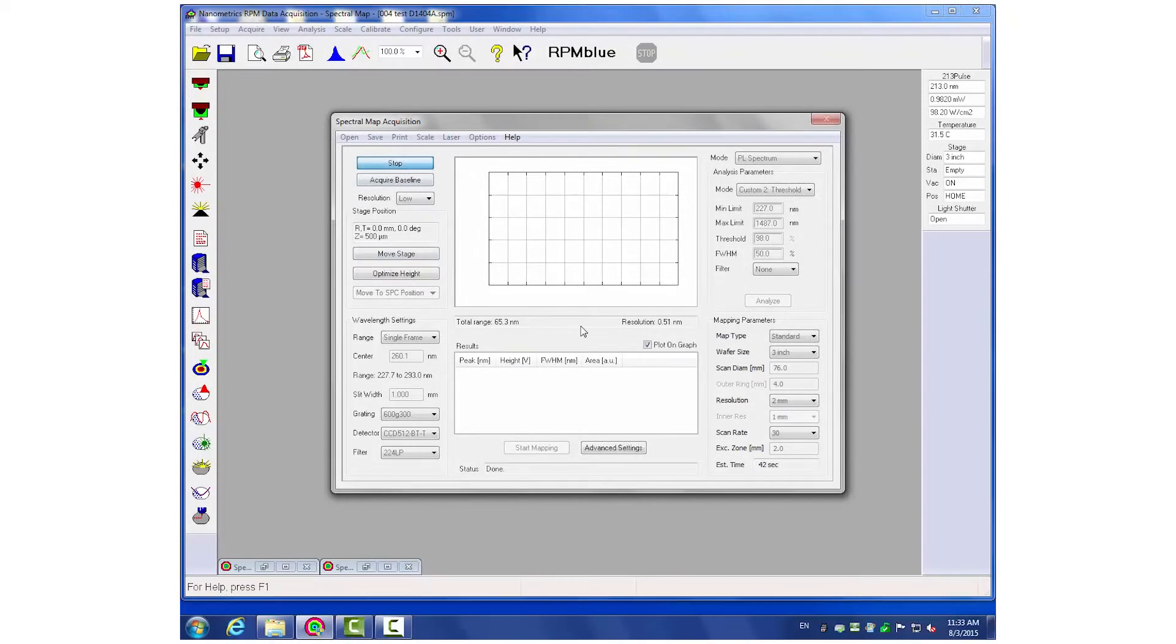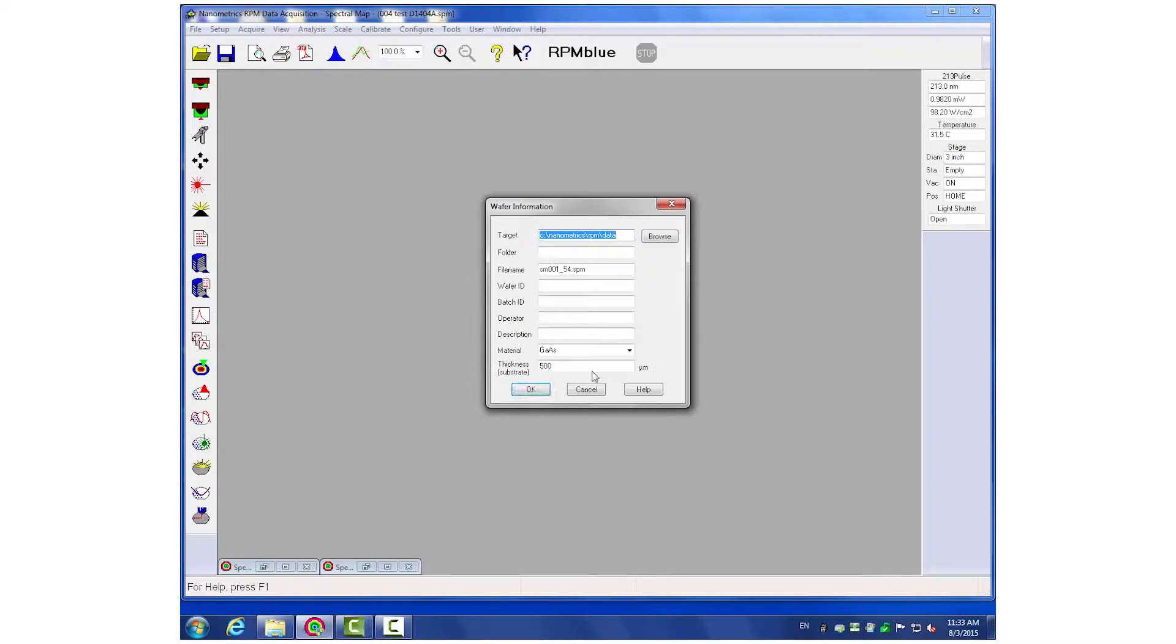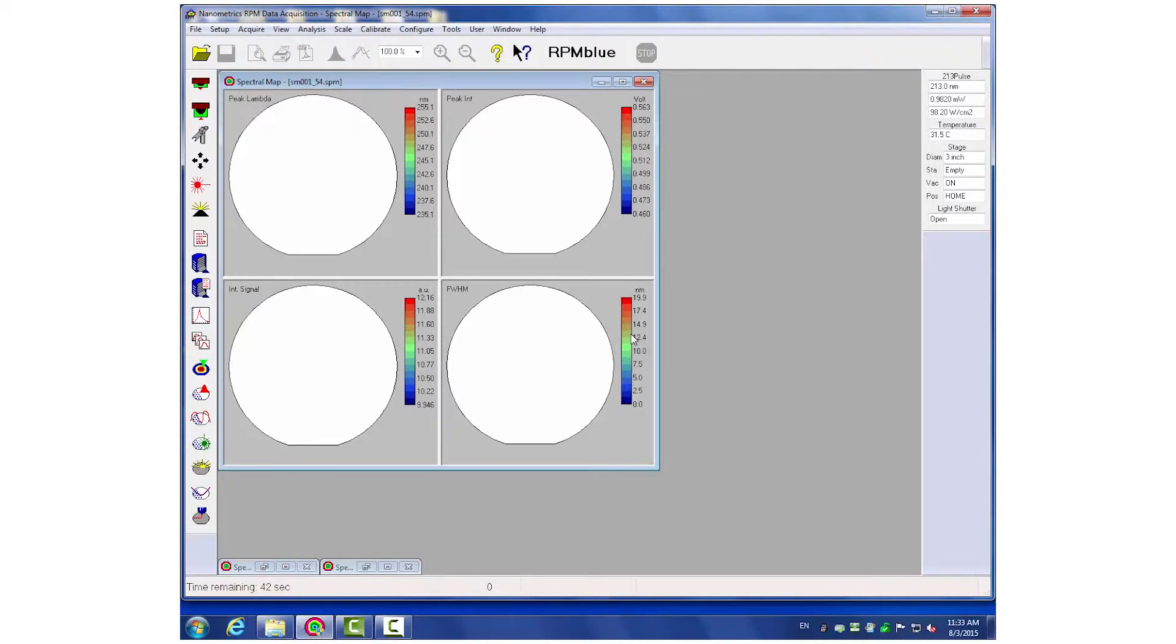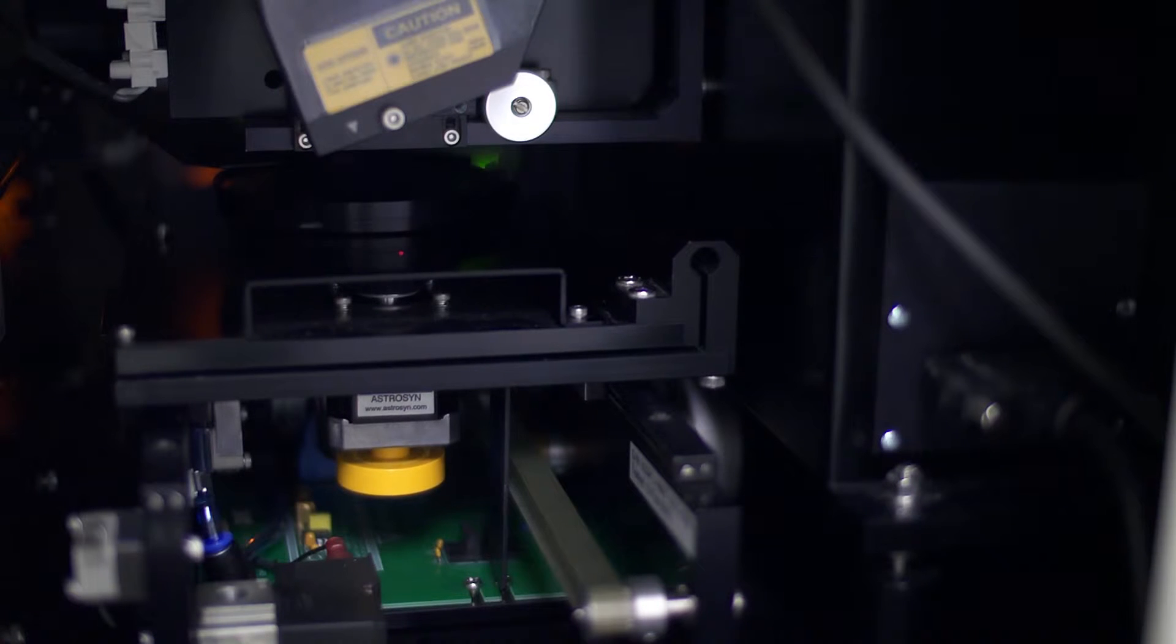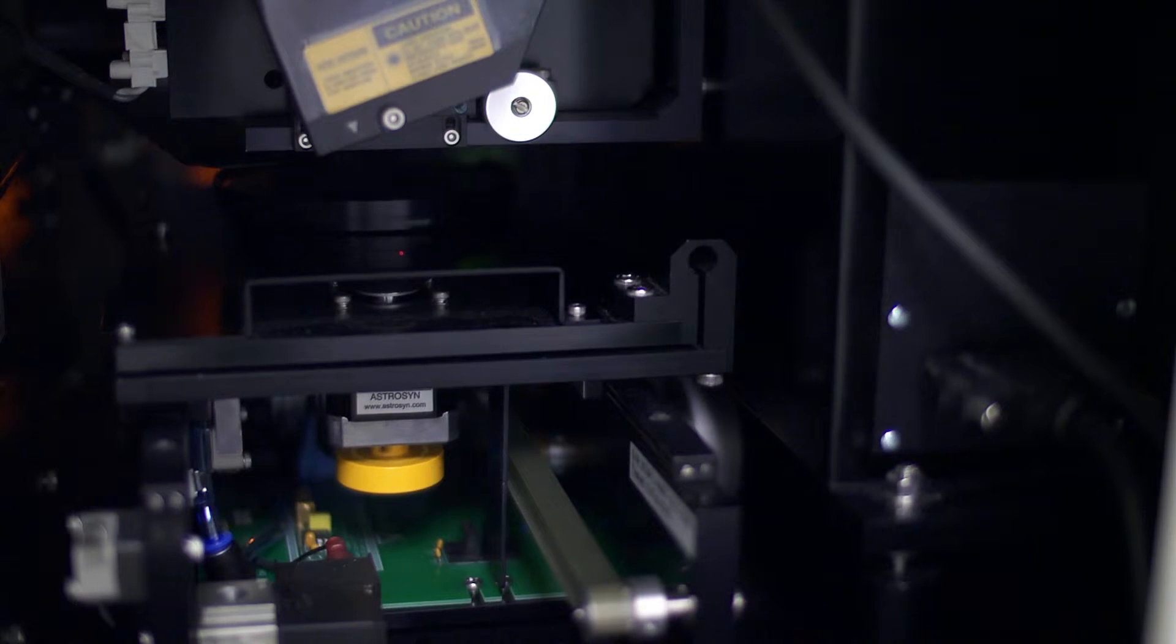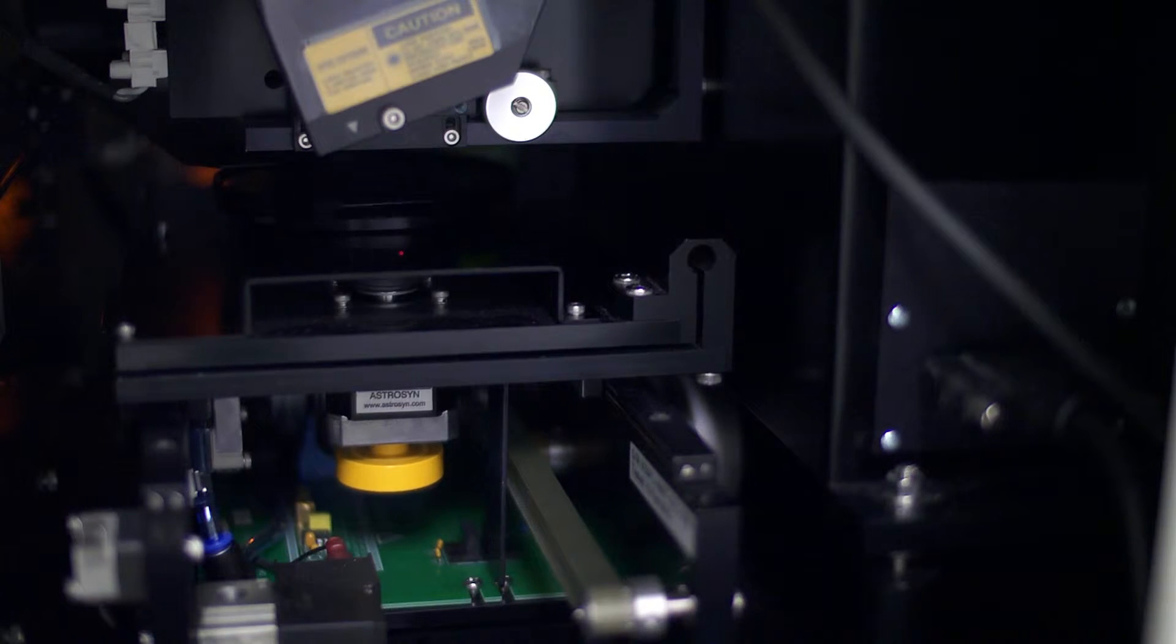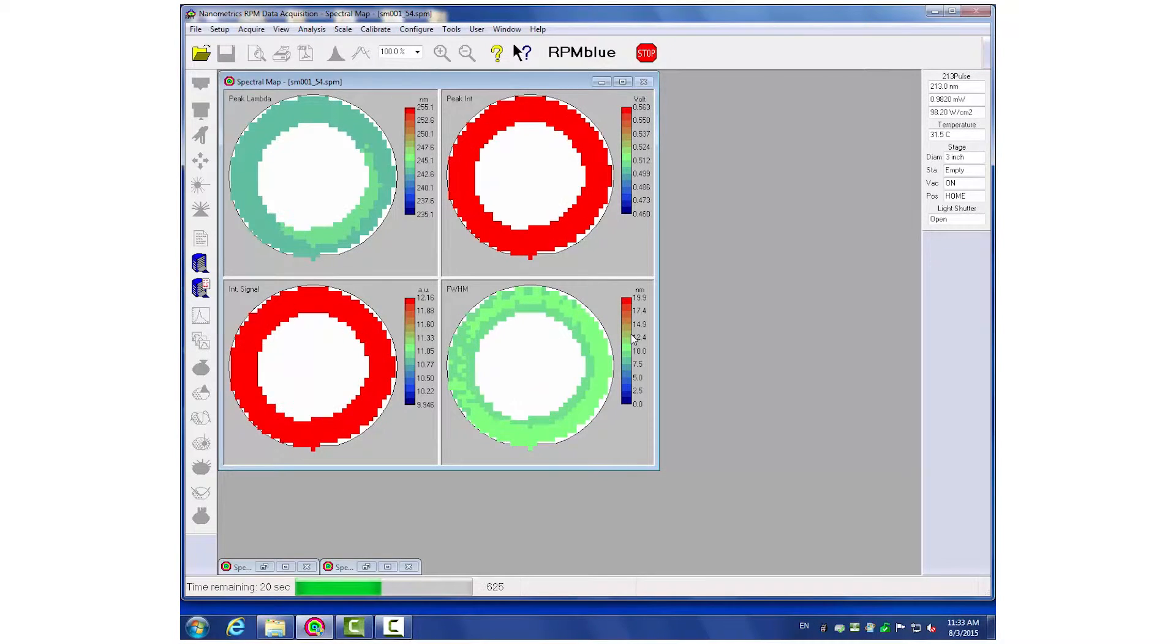The RPM Blue is capable of controlling up to eight MOCVD reactors with a throughput of about 35 wafers per hour on 4-inch samples and 80 wafers per hour on 2-inch LED wafers.